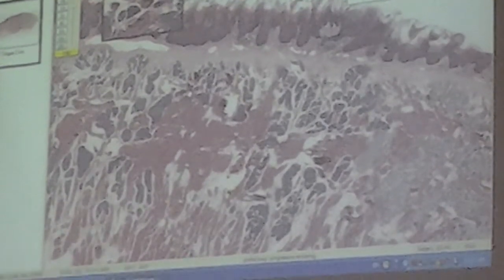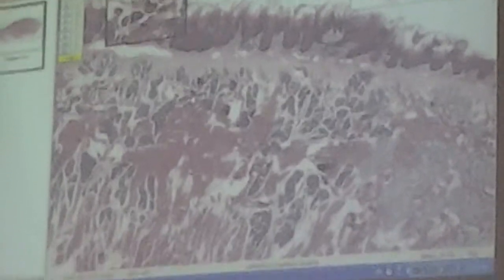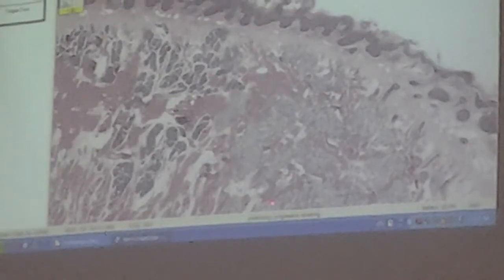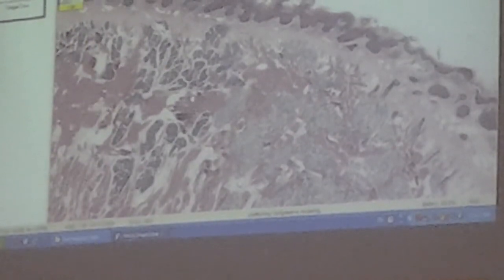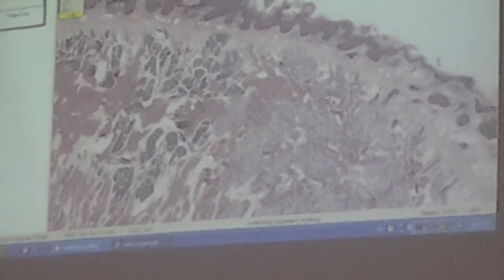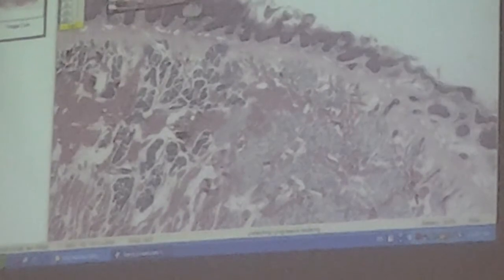If you see a gland white in color, like what you see here, these are mucous glands. The anterior two-thirds of the tongue does not contain mucous glands. Mucous glands only exist within the posterior third of the tongue.